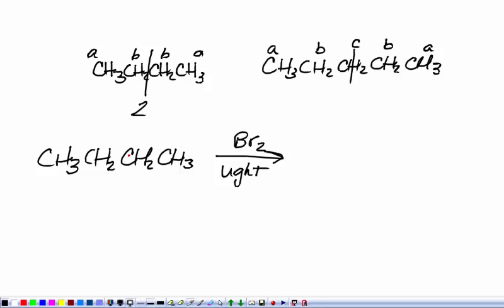So like those two methyl groups on the ends, aren't they always going to be equivalent? What is a case when they wouldn't be?